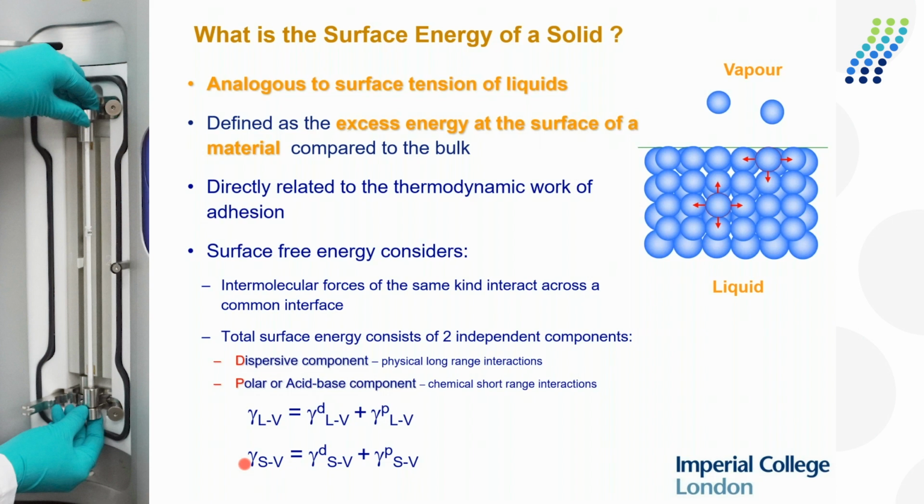So these are the basic parameters I need to know about for the liquid that's going to be used as my binder agent or is going to wet my powders. And I also need to know these similar properties for the powder that I'm actually planning to granulate. And what we'll see is if we can measure these properties, we have some reasonable opportunity to predict the performance of our granulated materials. So let's talk about measuring the surface energies of solids.